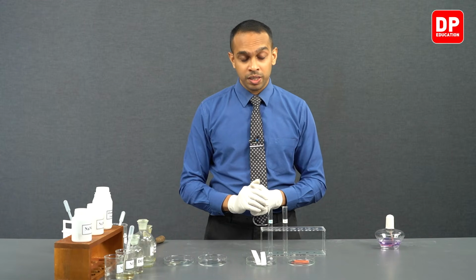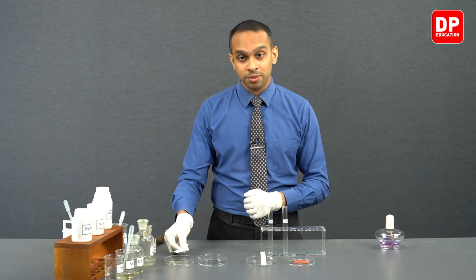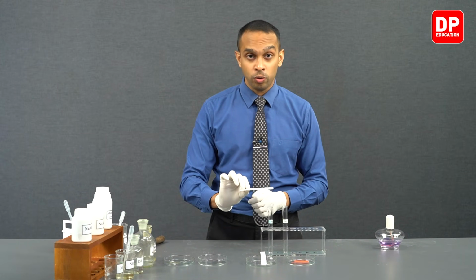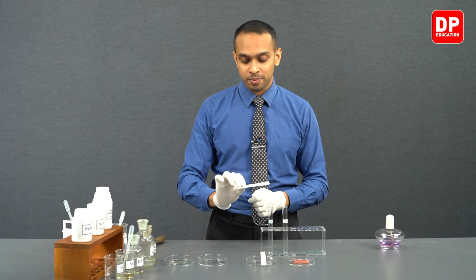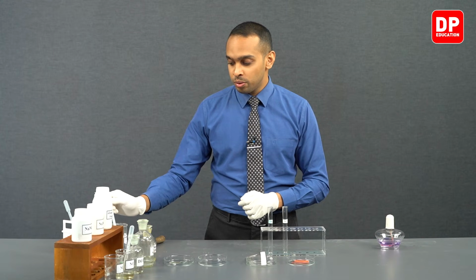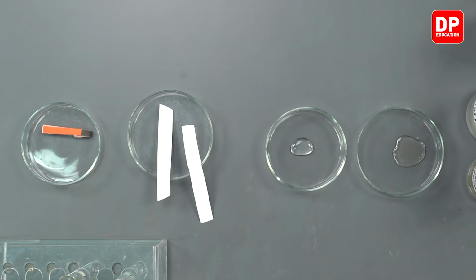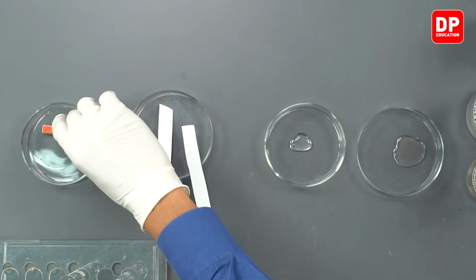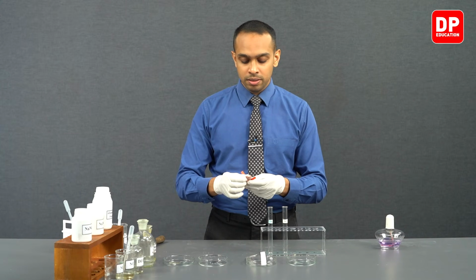And as we start the reaction, we are quickly going to soak one filter paper with Nessler's reagent, and hold it over the ammonia gas that is released. And then later on, we are going to take a red litmus paper, and we have now taken a little bit of distilled water into another petri dish.